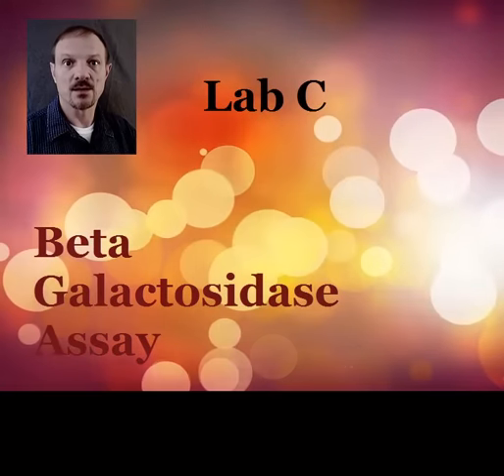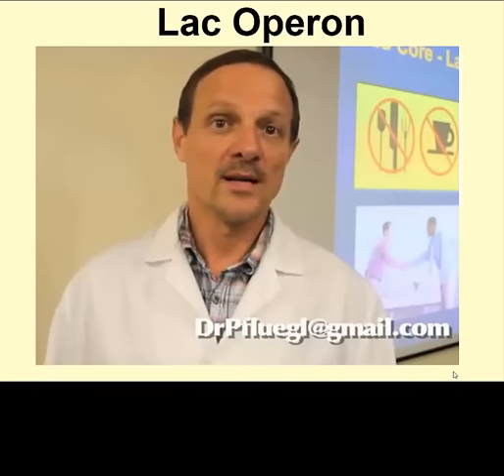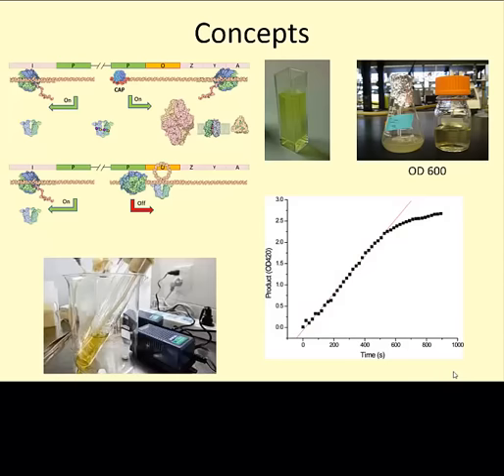The following presentation will cover some background needed for your next laboratory. In this week's lab, you will be working with E. coli cultures, use an enzyme activity assay, and we will introduce the use of the spectrophotometer. The concepts covered in this lab will include understanding of the lac operon and its function, using a protein activity assay to determine enzymatic activity, and using the spectrophotometer to determine cell density.